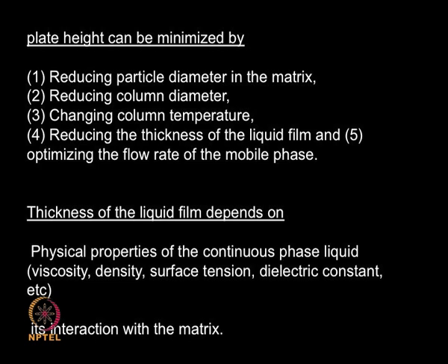Reducing the thickness of the liquid film. If you have any liquid present on the stationary phase, and I reduce the thickness of the liquid film, I will be able to improve the plate height. Optimize the flow rate of the mobile phase. I need to adjust the flow rate of the mobile phase so the plate height becomes good.